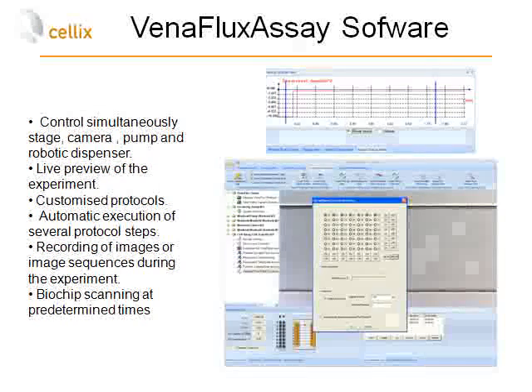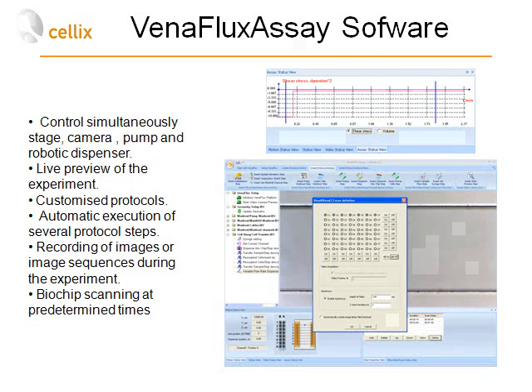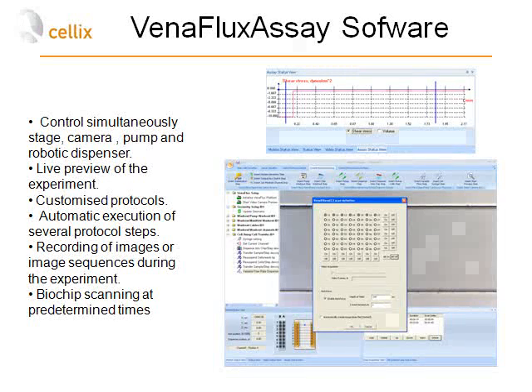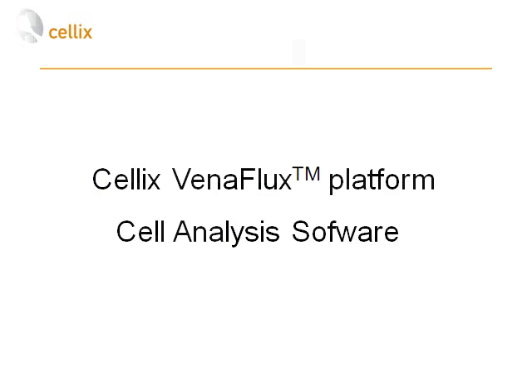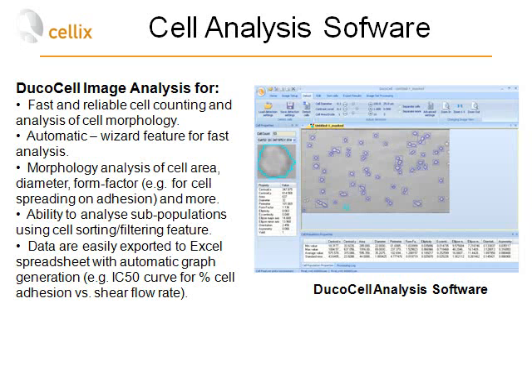The software also provides a live preview of the experiment. It allows you to load customized protocols, modify them, and save them to different files. You can automatically execute several steps of the protocol and record images or sequences of images from predetermined positions on the chip. A dialog shows that seven positions of the chip have been selected to be scanned, and the biochips can be scanned at predetermined times. The graph on top shows with a blue line when the biochip will be scanned and how the shear stress is changing during that particular experiment. Once images are collected, there is a need to analyze the number of cells attached, cells rolling, and the morphology of cells during different experiments.